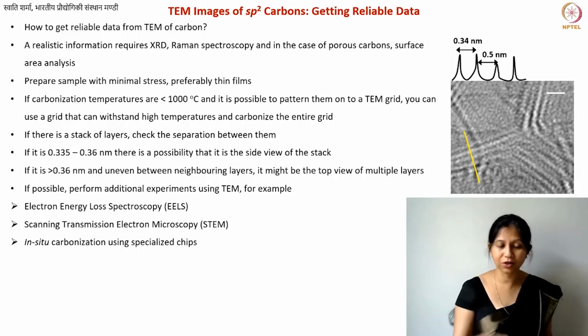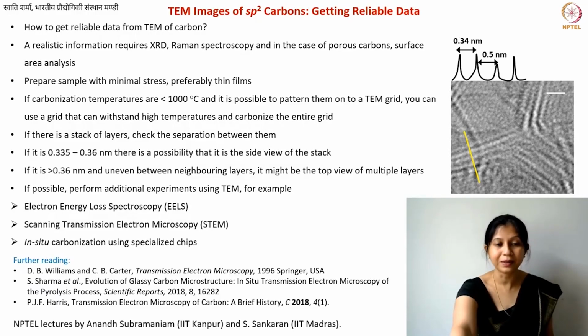I will also provide a citation of my own paper where I have performed this, so maybe you will get some idea from there. From that paper, I have also taken some of these images, so this is also for the citation, the acknowledgement. If possible, make sure that you don't contaminate the TEM setup, but you can perform in situ experiments as well.